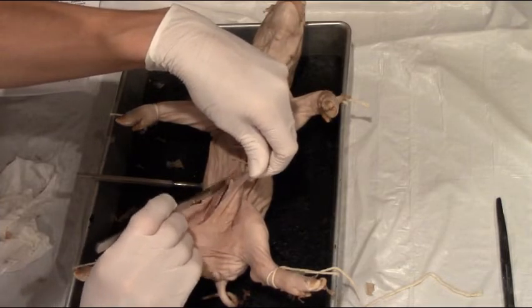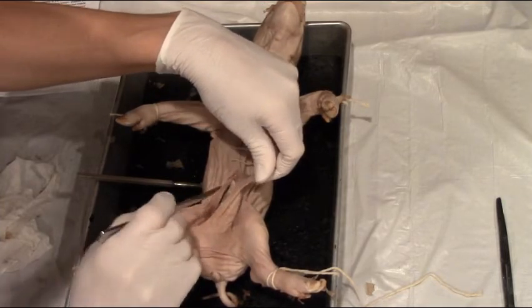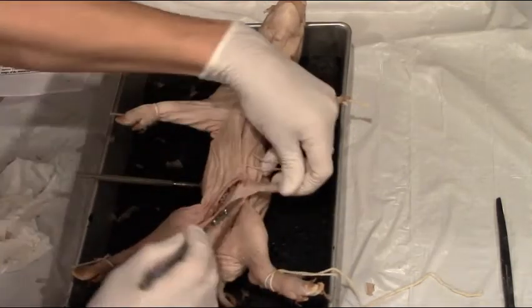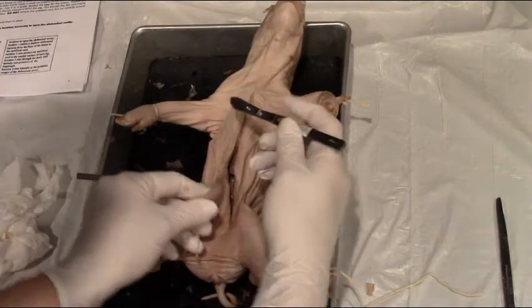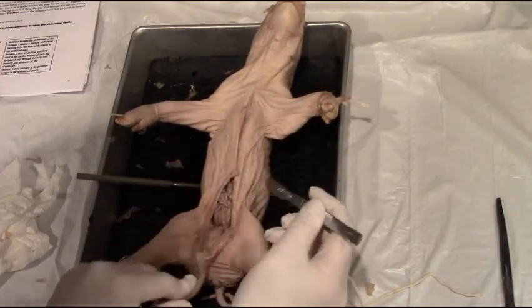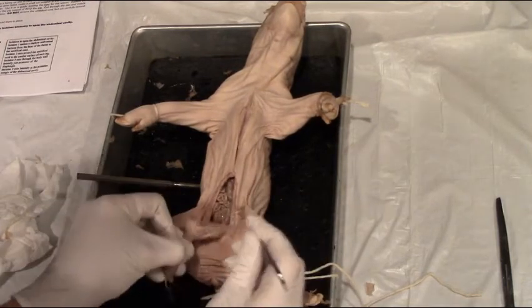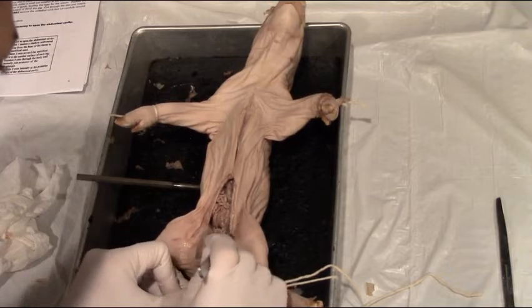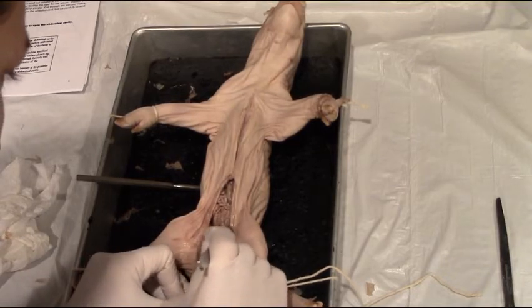I can't quite pull the umbilical cord down yet, so I'm going to cut through the blood vessel that's currently connected right there. You can see how I'm pulling away and going back and forth. There we go — I should be able to pull that umbilical cord all the way down. So you are going to cut a blood vessel. Then cut a little bit further into each leg.